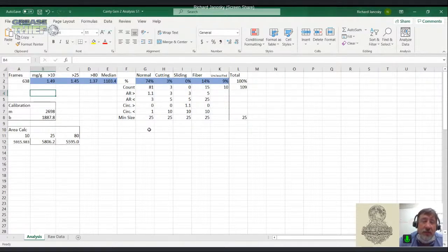So in this subcommittee, they're looking at this Hegman gauge, which is a bit of a manual process, but it's something that allows you to look at particles and put them into different size classifications. And that Hegman gauge does have this greater than 10, greater than 25, greater than 80. Now they've gone back and forth between greater than 75 and greater than 80, but it's again in this same ballpark. It's at 3 different ranges and so on.